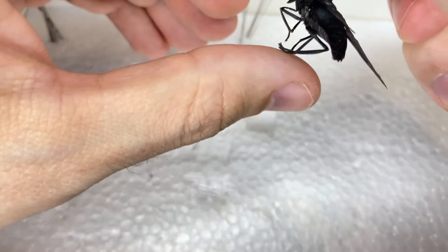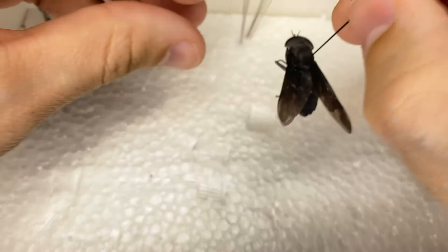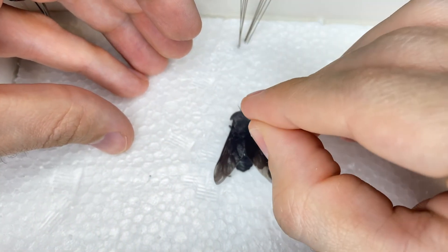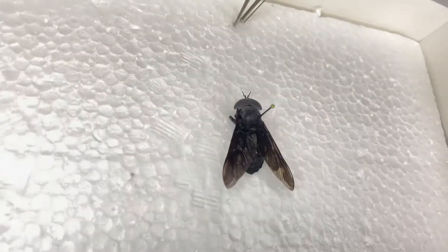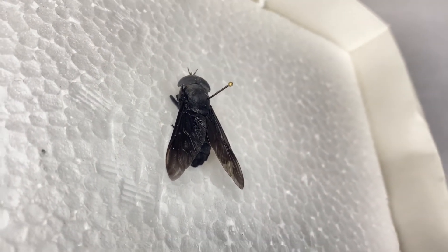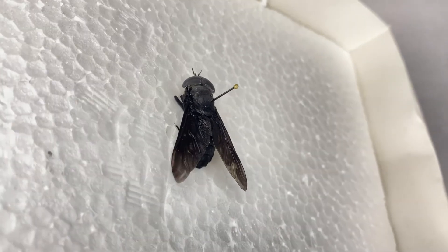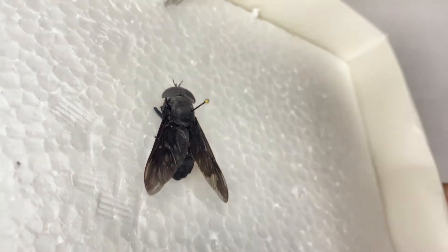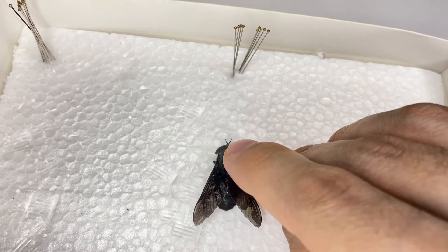I'm going to make sure the legs are more or less how I want them, then pin this down into my styrofoam. You do want a little bit of space at the top, because on the insect there'll be two labels — the label where you found it, and a second label with the species information. We could push it in a little bit more, but my foam is not very thick, so I just want to make sure I'm not getting through to the table.